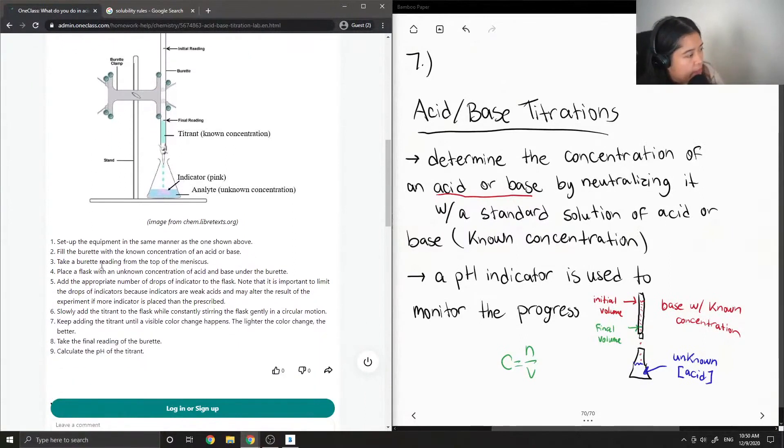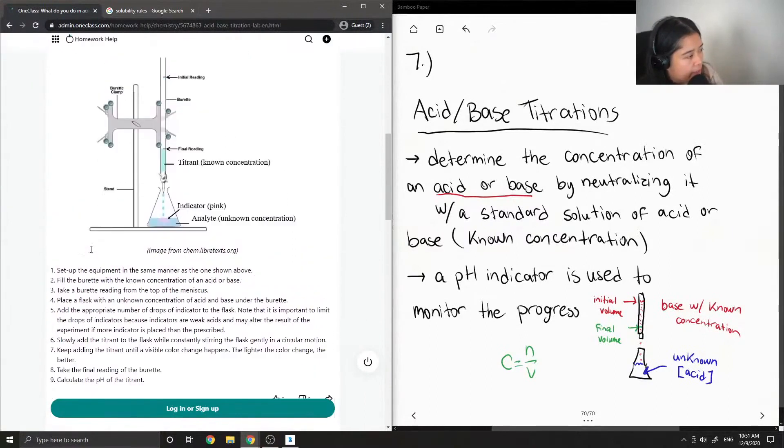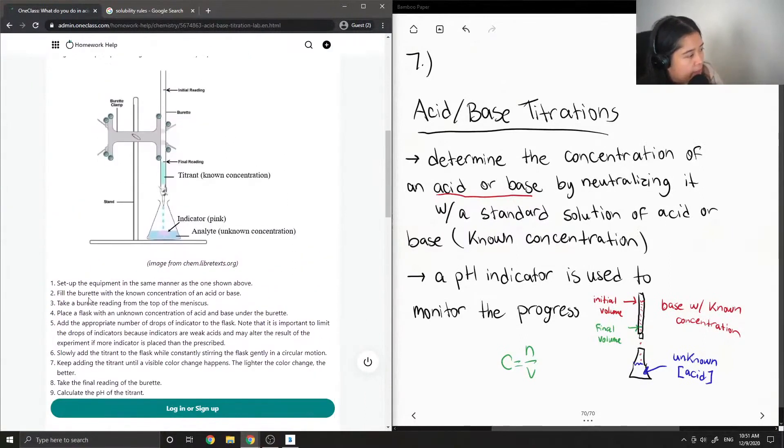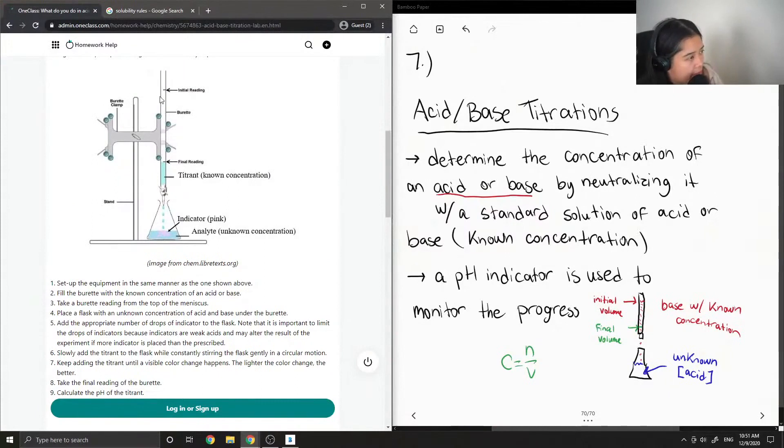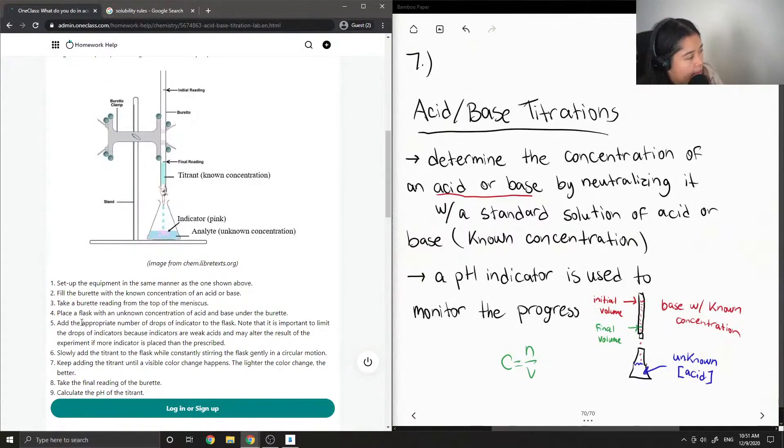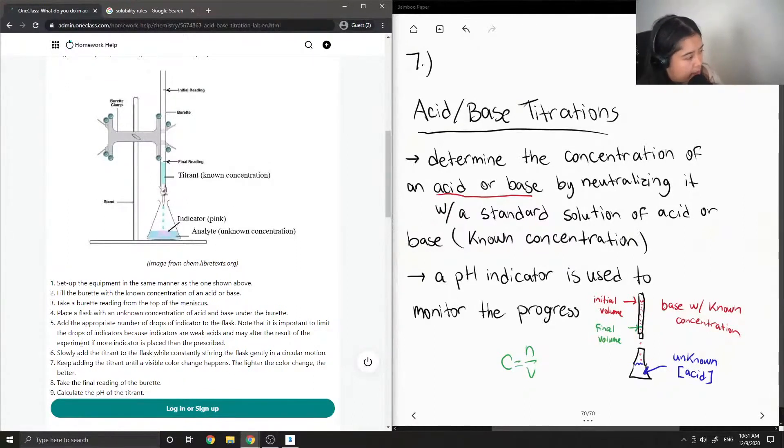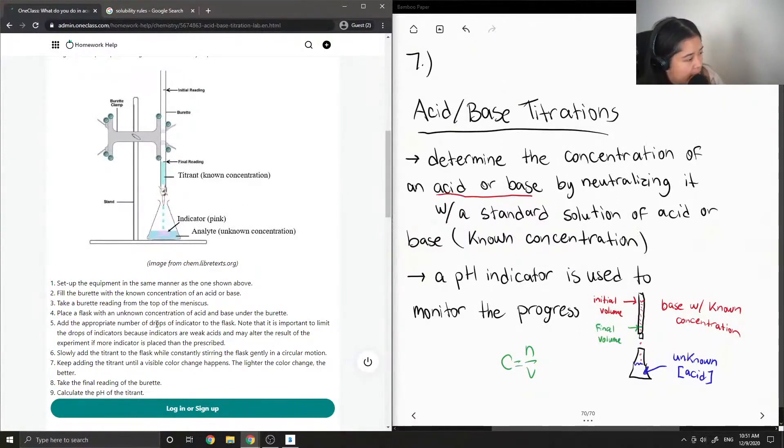Step one: set up the equipment. Two: fill the burette with known concentration of acid or base. Three: take a burette reading from the top of the meniscus—this is the initial reading. Four: place a flask with unknown concentration of acid and base. Five: add the appropriate number of drops of indicator, usually one or two drops.